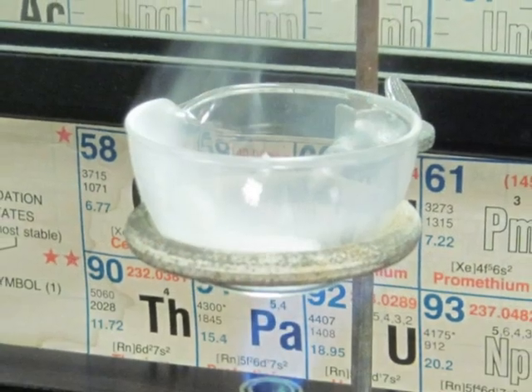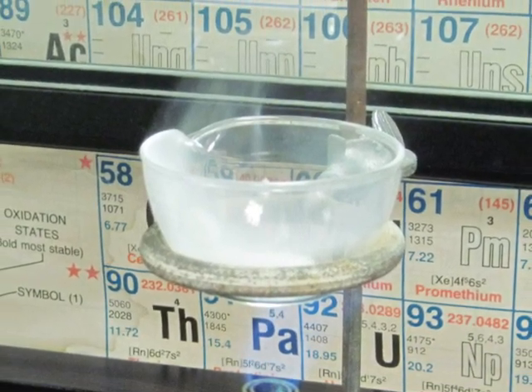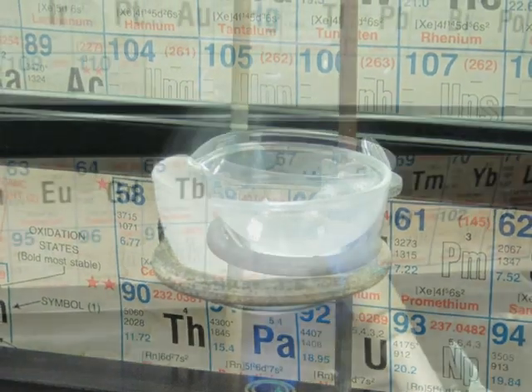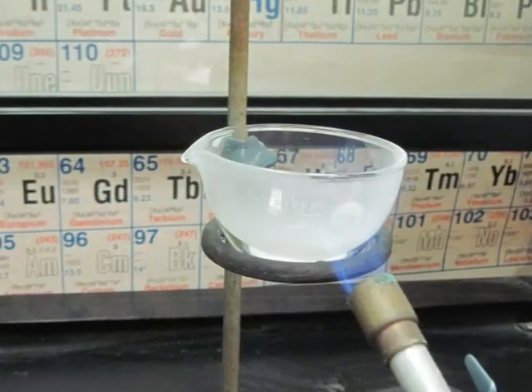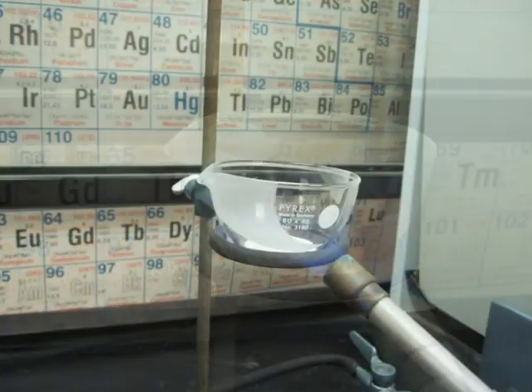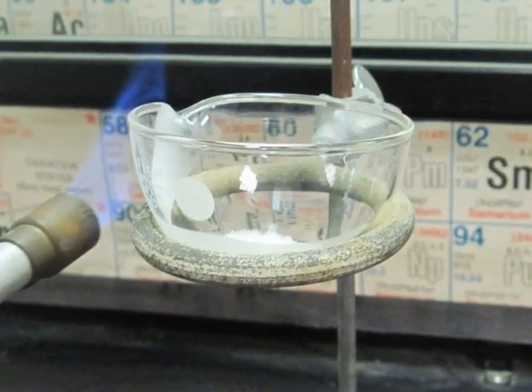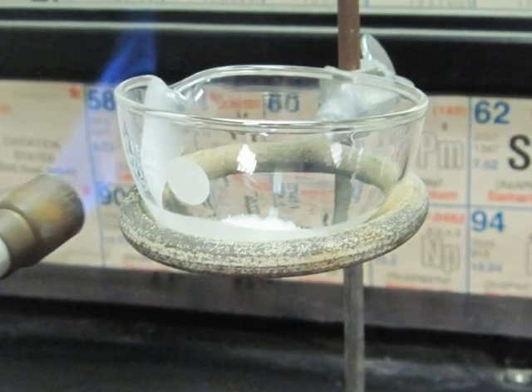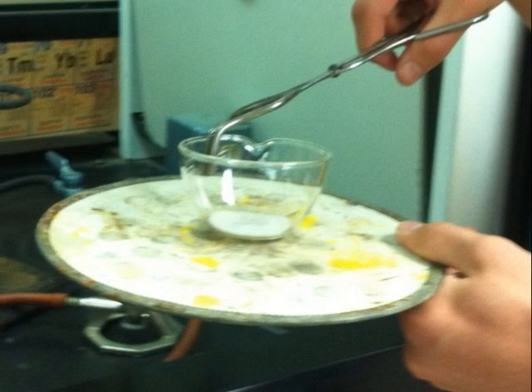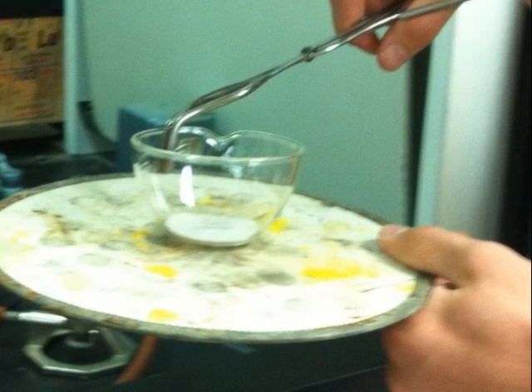The smoke-like substance is the ammonium chloride redepositing into tiny solid particles as it cools in the air above the evaporating dish. Be sure to drive off any film that deposits on the side of the dish. You may need to readjust the dish to reach any residue close to the ring. Carefully transfer the hot dish to the lab area to allow other students access to the fume hood.